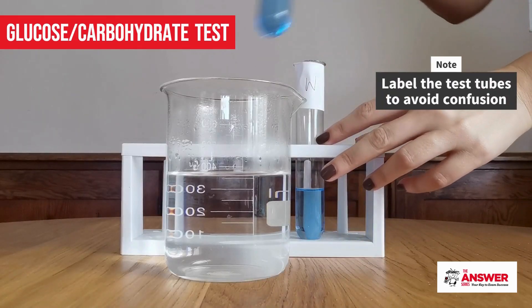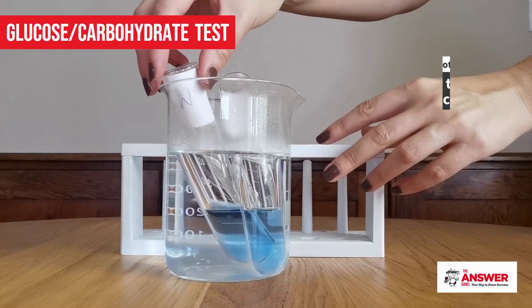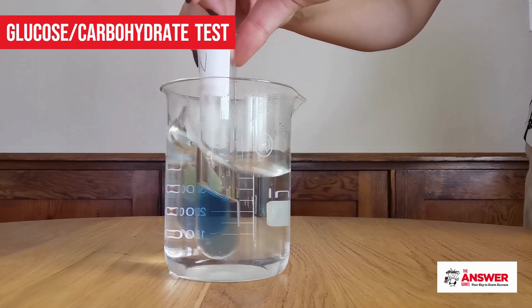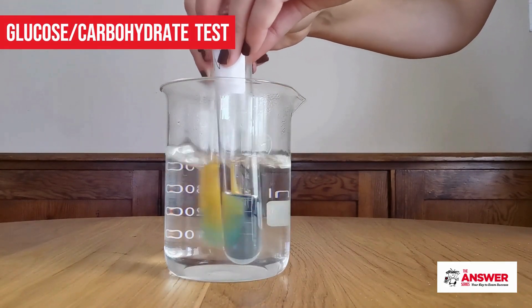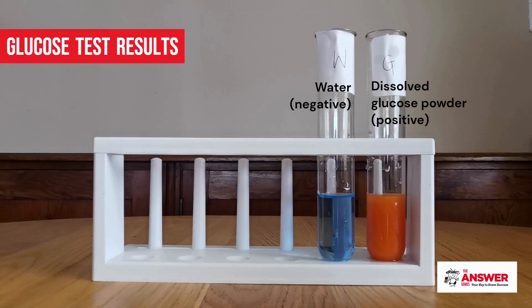Place the test tubes in a water bath with boiling hot water. Allow them to rest in the water for a few minutes, stirring occasionally to disperse the heat through the solutions. Observe the color change — a blue color indicates a negative test for glucose, whilst brick orange or a reddish brown indicates a positive test.